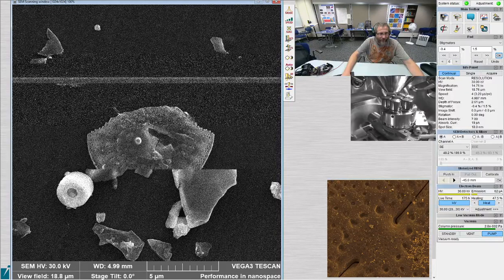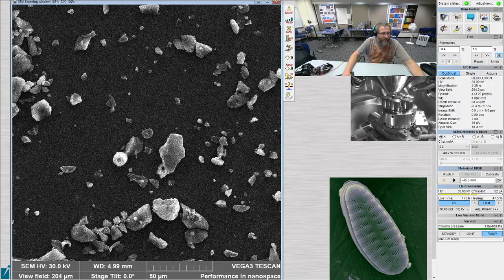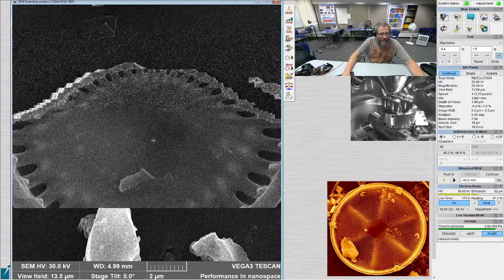Hmm. Oh, look at that! It's just like one little horn on it. This is that same little guy with the transverse undulation. Do you think we have one species with transverse undulation or two? I think there's at least two. Yeah. There's the one with the really well-defined central area that's more flat and crusty, and then there's the one that, the one we were just looking at.